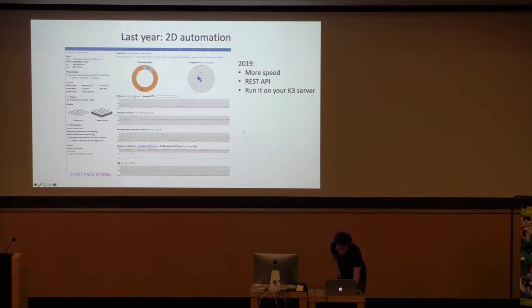So there haven't been that many changes since then. Most of them have been only under the hood. I don't think many users noticed, except that hopefully their user experience got a bit more pleasant.